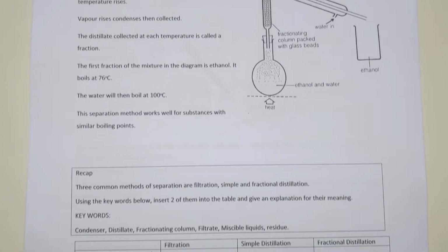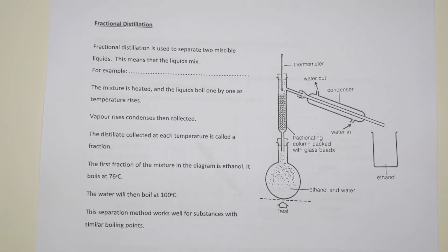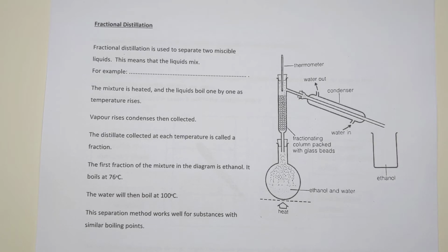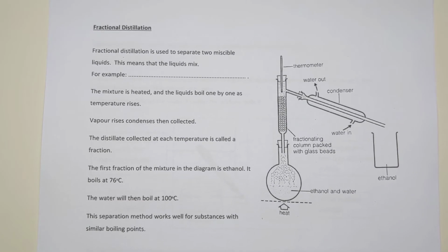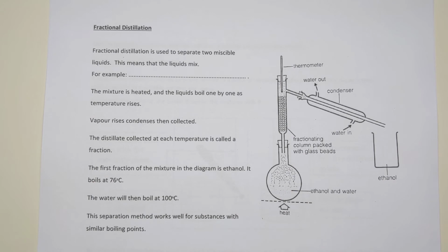Now we move on to something that looks pretty much the same, confusingly, fractional distillation. It's got the word distillation in it, and it also has a similar looking apparatus. However, it's got a slightly different use than simple distillation. So simple distillation, I was trying to get a liquid back from a solution of like a salt in water. I would use this technique called fractional distillation if I'm trying to separate two liquids.